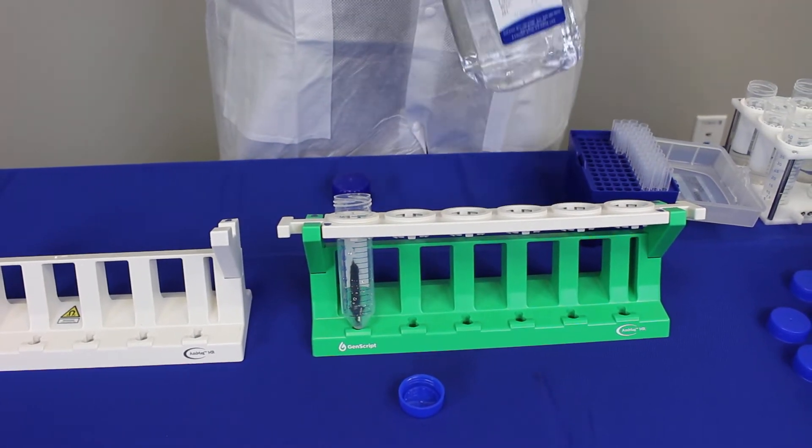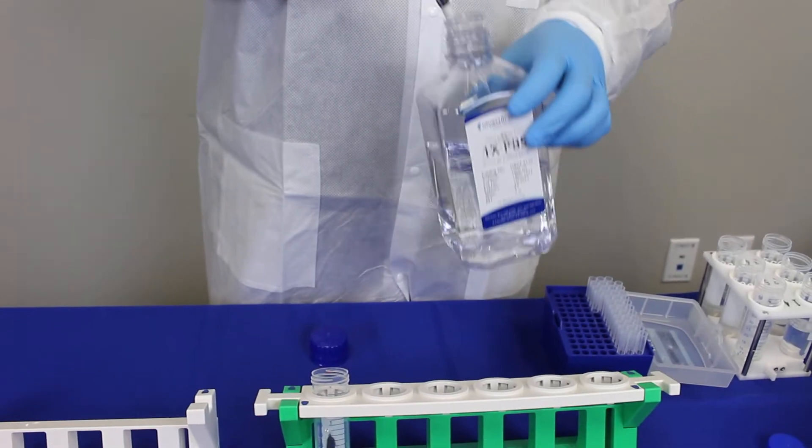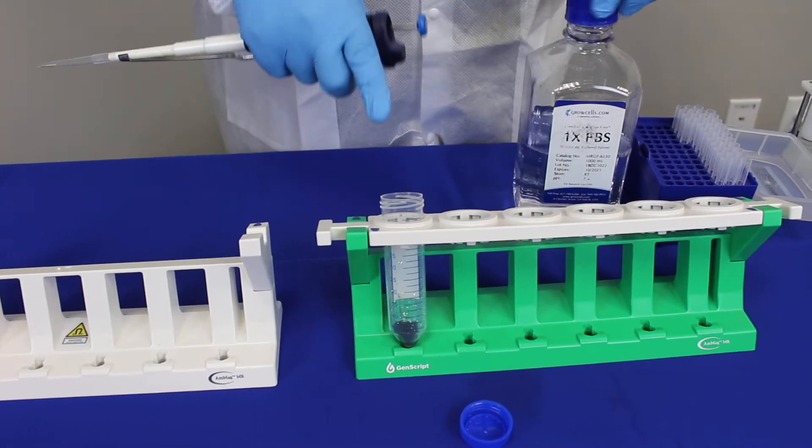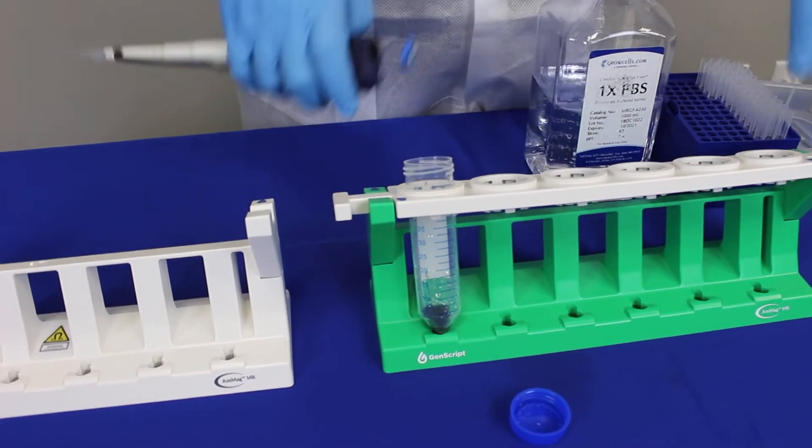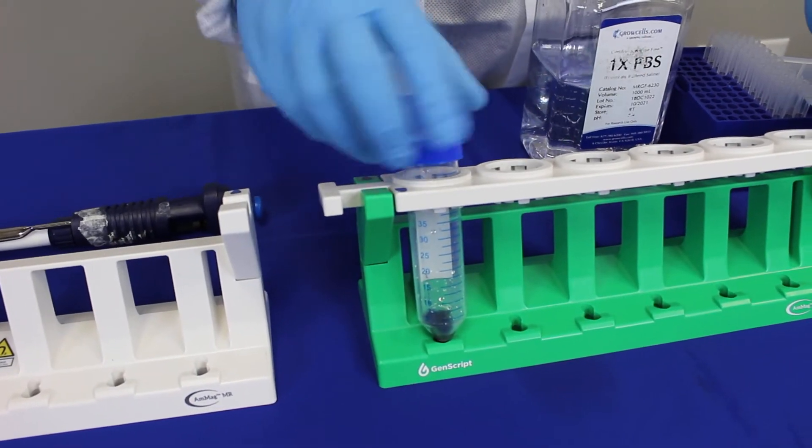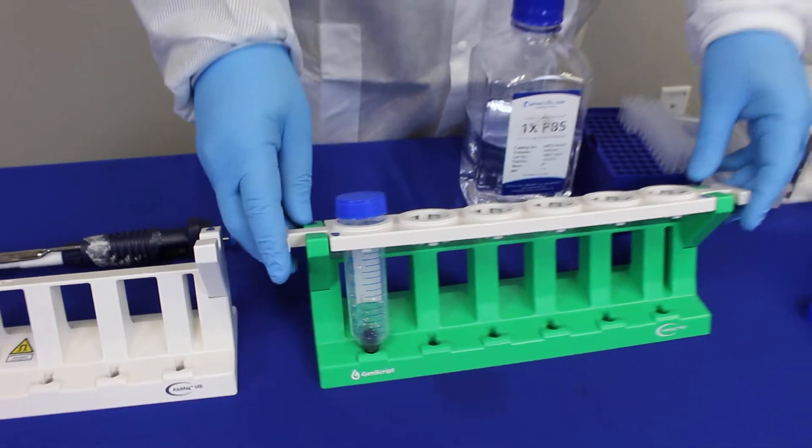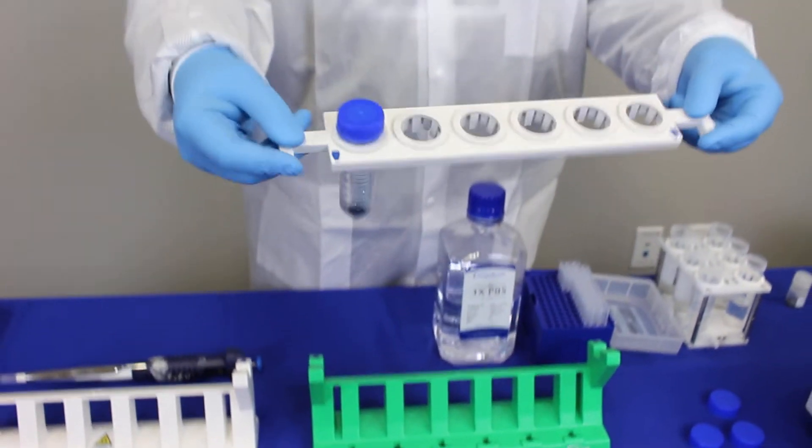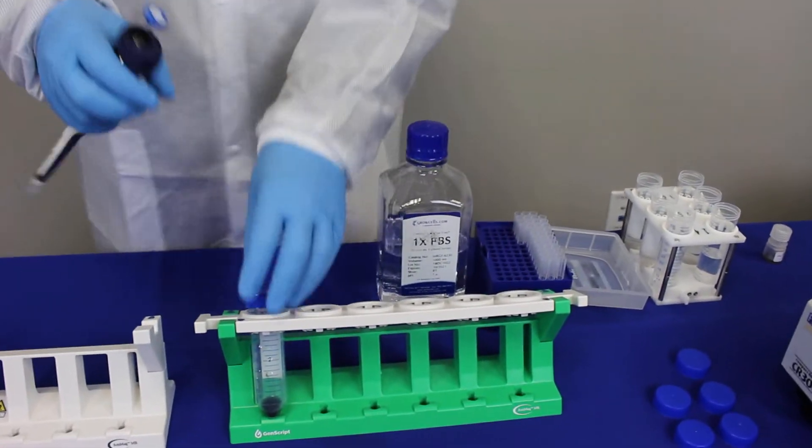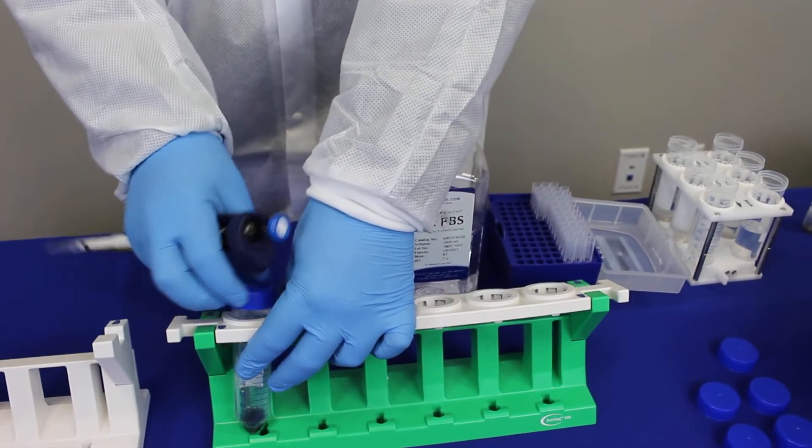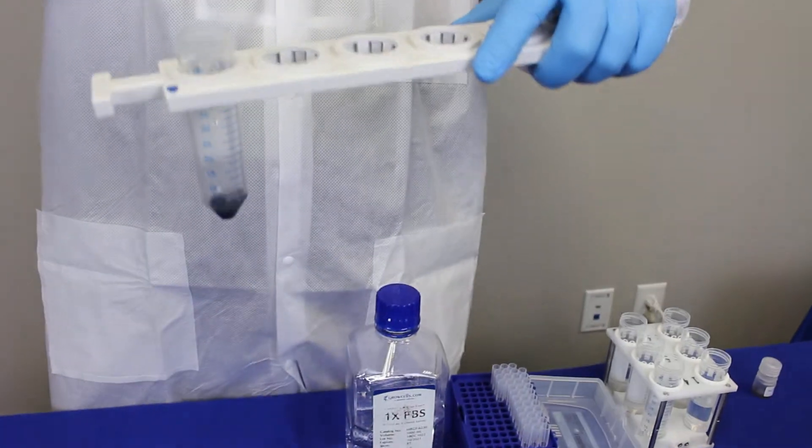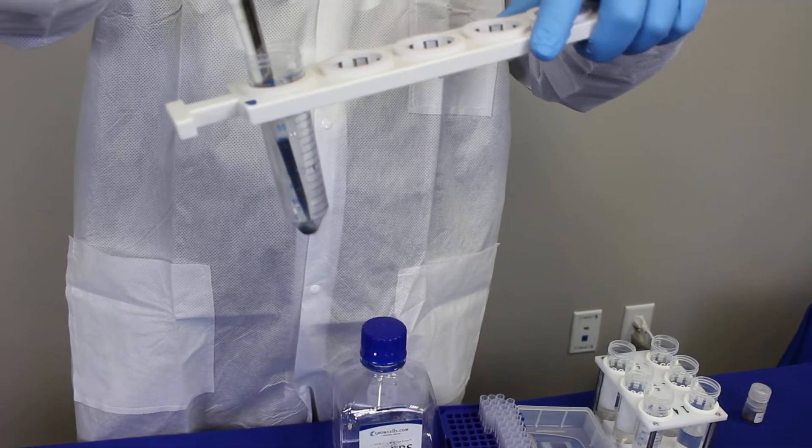Now you have to put equal amount of PBS into the tube, which has the same amount of settled beads. So suppose it's 1 ml of settled beads, you just put 1 ml of PBS here to make it a 50% slurry. Make sure that it is mixed, and once this is mixed, you're going to add it to your samples.